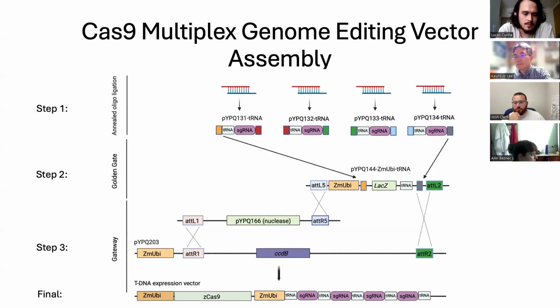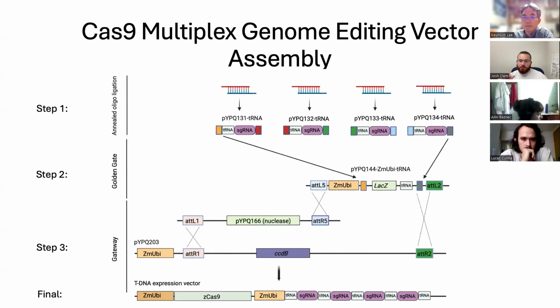Sure. If you're having difficulty with the polycistronic approach, I would say test out the polymerase 3 promoter approach, because there's nothing wrong with using that system per se. There are a few potential advantages of using Pol II, right? One of them being that you have coordinated gene expression between all of your guide RNAs, essentially, because they're all driven by the same polymerase machinery.